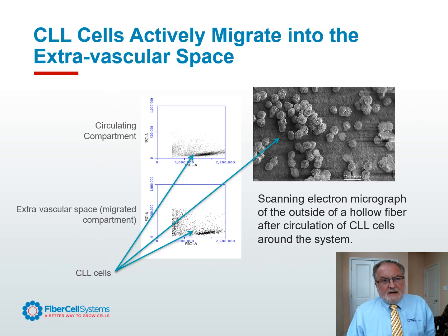In this particular case, the researchers added circulating leukemic lymphocytes to the media circulating through the insides of the fiber and watched for their interaction with the endothelial cells. As it turned out, the CLLs would specifically interact with the endothelial cells, but only under conditions of chronic shear, where they would attach and then transmigrate through the fiber. This is a model for cancer metastasis, very significant findings. I believe the same mechanisms are in force for stem cell homing as well.